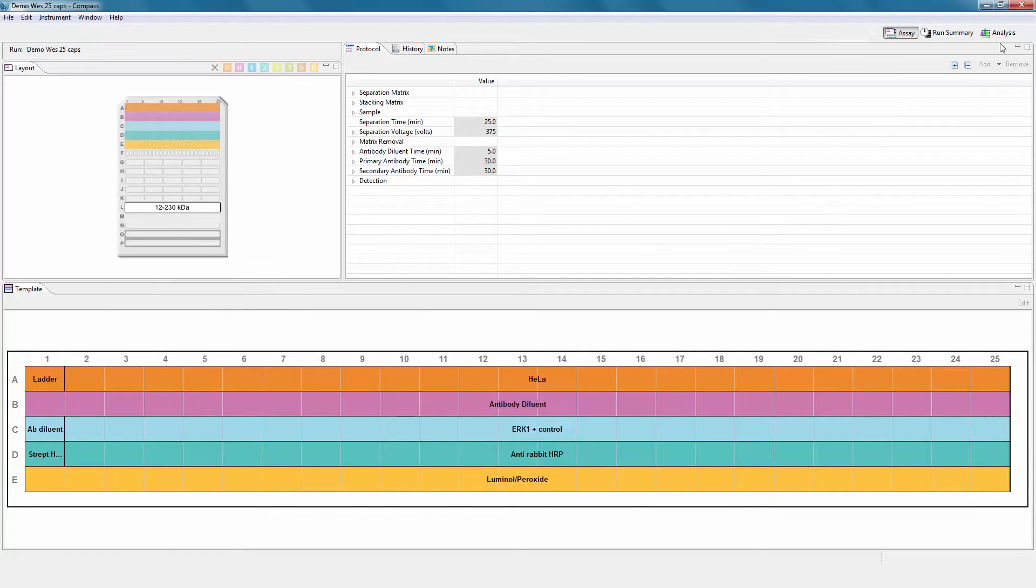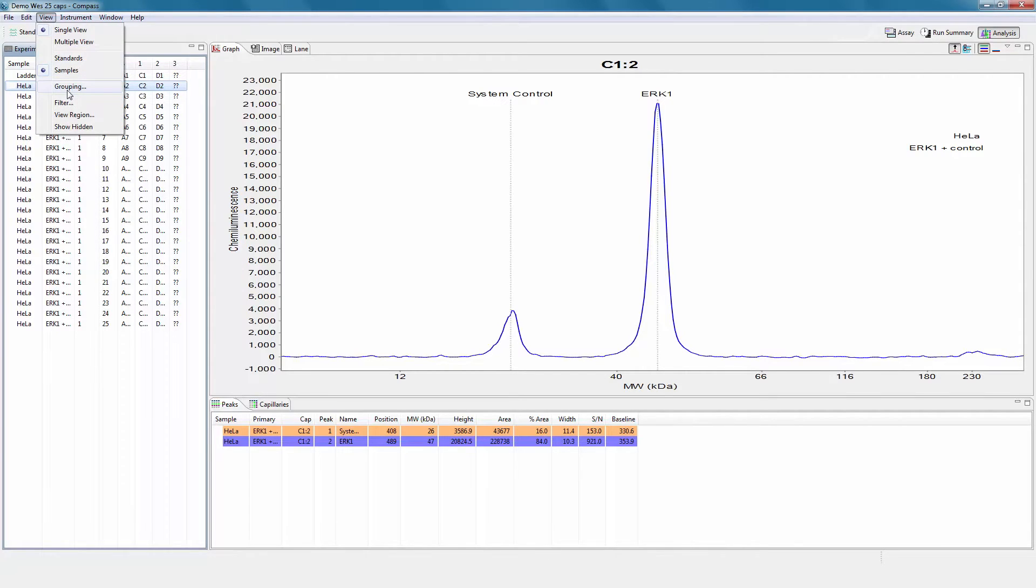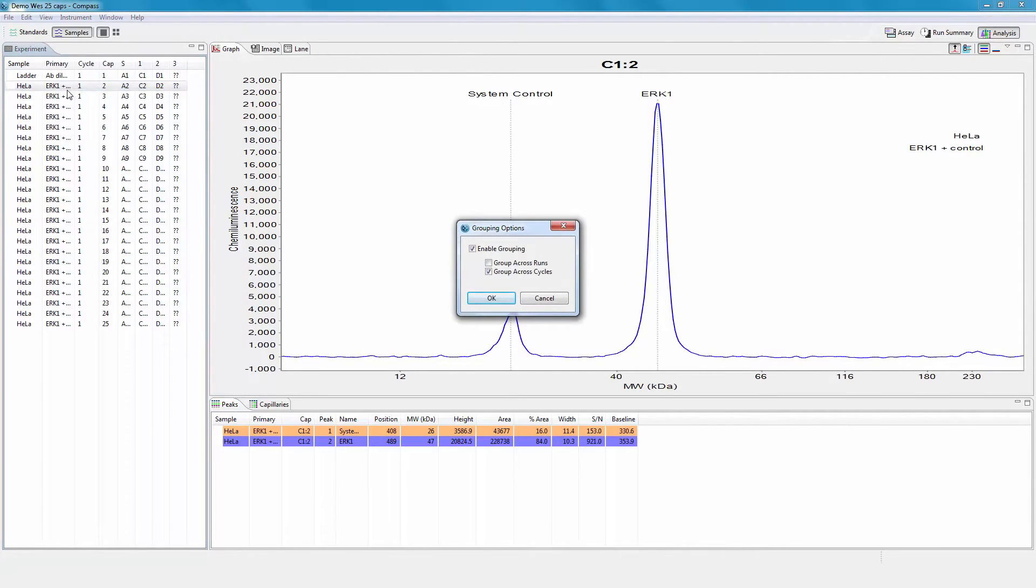Select the analysis tab. Group your results and view the associated statistics by selecting view and clicking on grouping. In the box grouping options, check the box to enable grouping.